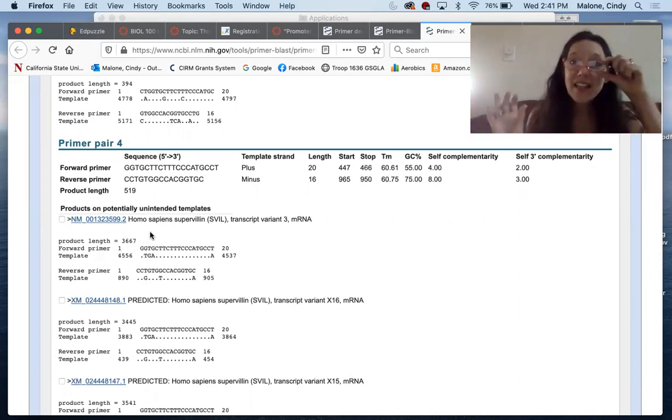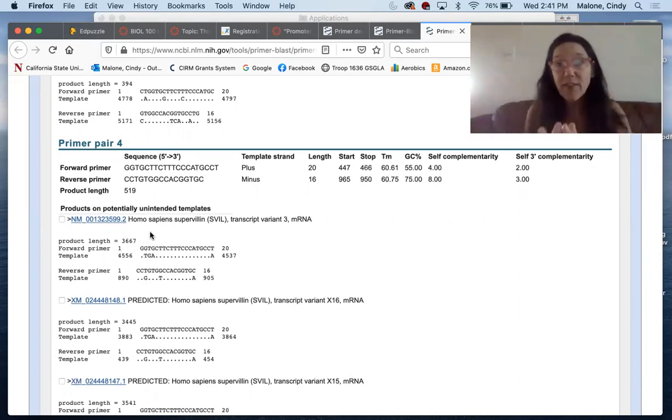So unless that template sucks up all of our primers, so none of them sits on ours, which is 100% homologous complementary base pairing, that might happen, but shouldn't. This band won't confuse us because it'll be huge on the gel. It'll be nowhere near our 500 base pairs. So it could still be fine, okay?